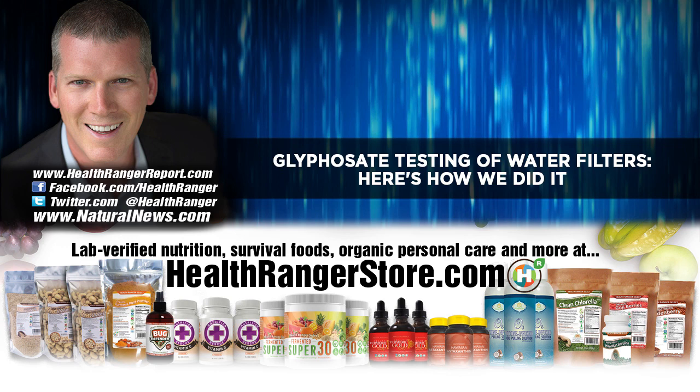But this podcast here is to give a little bit more background about how we do these tests and how we came up with the method to conduct this testing. It took us over 2 years to develop and refine this method. And a lot of people think that lab testing is very simple. You just take a liquid and you somehow hand it over to an instrument, and then the instrument looks at it and gives you an automatic, accurate result. Boom, like instant science. Well, it doesn't work that way at all.